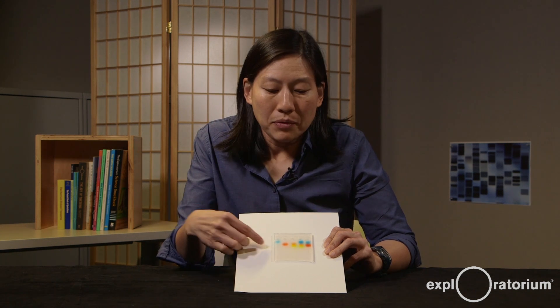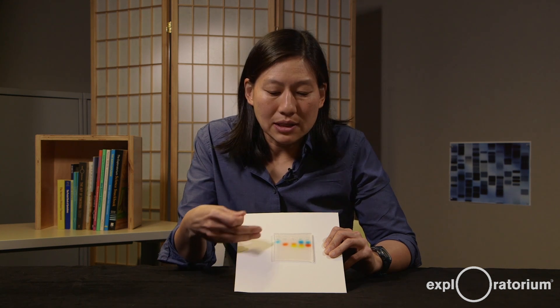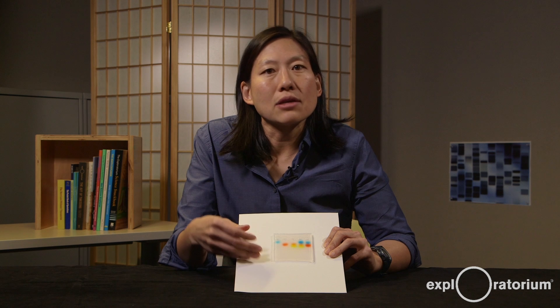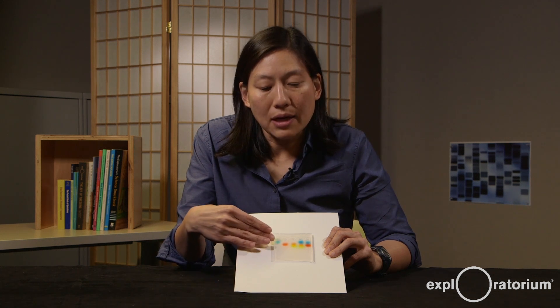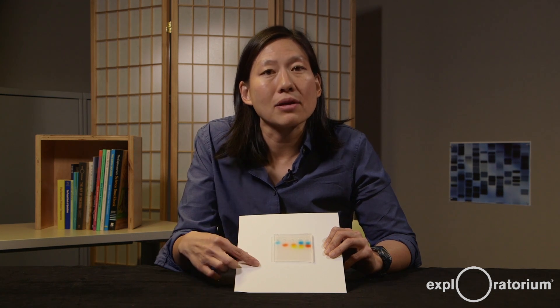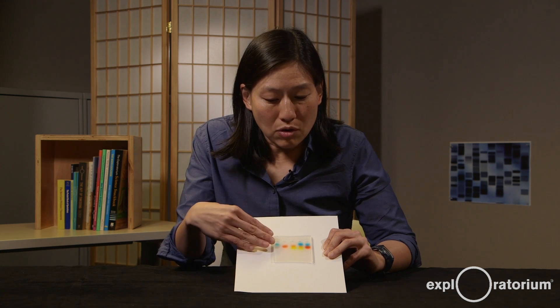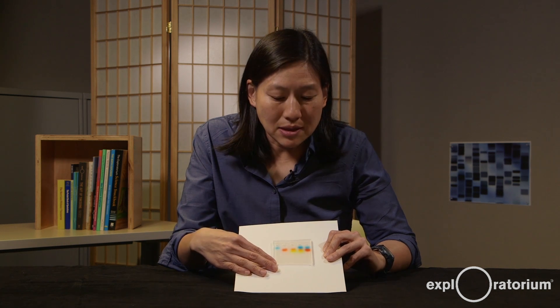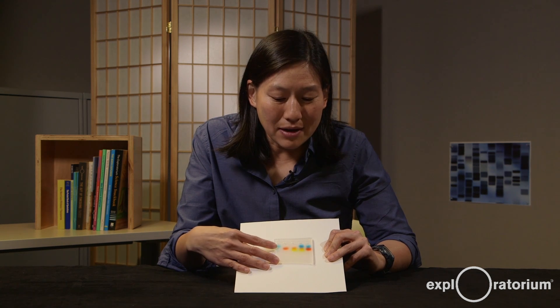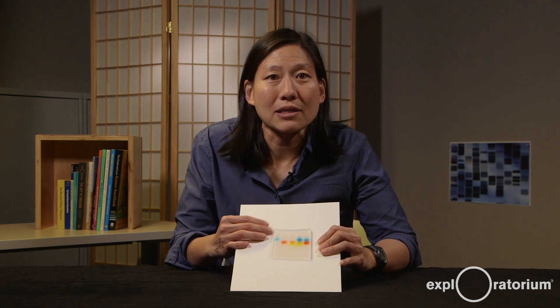That separation creates a banded pattern. You can either pick the size of DNA you want and manipulate it in the laboratory, or you can read the banded pattern itself — which is unique because when DNA is cut with certain enzymes, each person's specific DNA sequence produces a different pattern. That's the idea behind DNA fingerprinting. And because this gel uses food coloring dyes rather than DNA and a DNA dye, it's non-toxic and safe — you can dispose of it in the trash or wrap it in plastic wrap and save it.